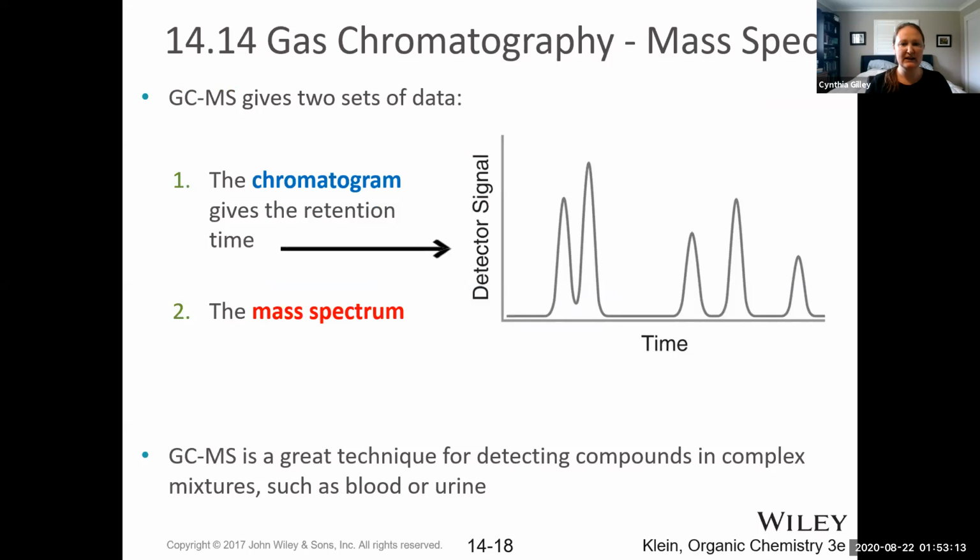Okay, so here's an example of what you might get for a spectrum from the GC. The GC will separate all of the compounds, and you can see that when the compounds are getting eluted from the GC, we see a peak. In this particular mixture, there are 5 compounds, because we see 5 of these peaks, and they are fairly effectively separated on the column, which is great.